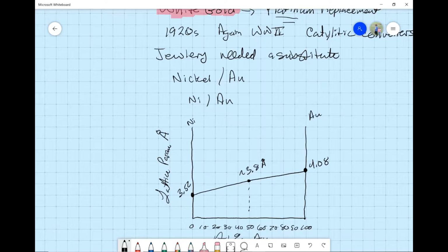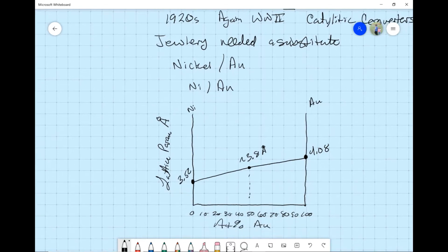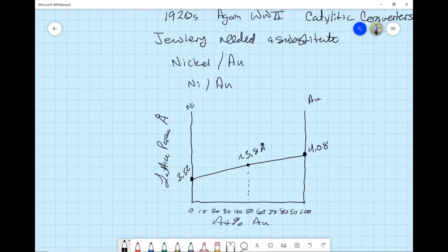And kind of an application of this type of analysis would be for mechanical alloying, where you don't melt the materials together, you put them in a ball mill, like a high velocity ball mill, and kind of grind them together. And then you can tell how effective you were at your alloying process this way. Anyway, again, as always, hope this was informative.